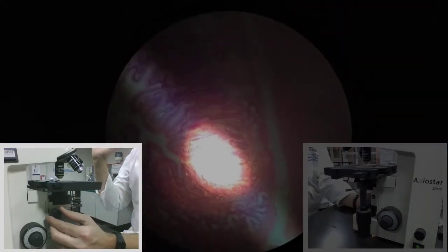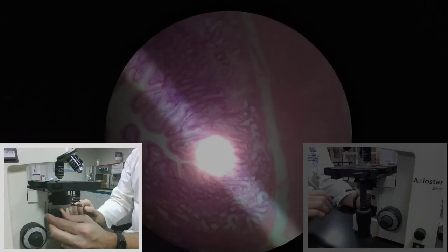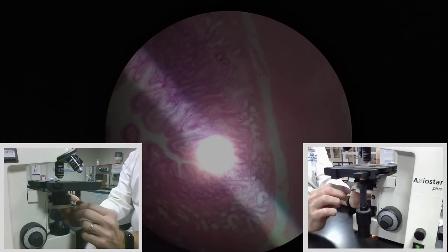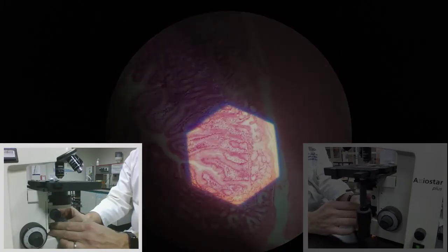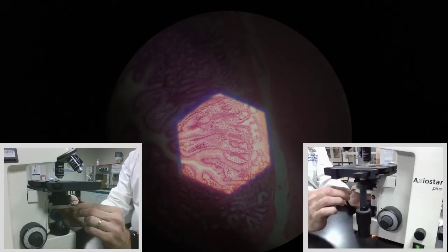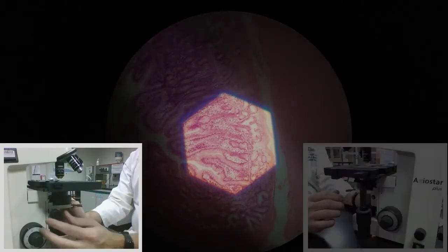My camera is not really focusing very well, unfortunately. What I'm trying to get is a nice sharp hexagon shape, and I'm trying to get it into the middle of my field of view. I'm going to open up the field iris diaphragm a little bit just so you can see more clearly on the camera. You can see now that we have this shape with relatively sharp edges.